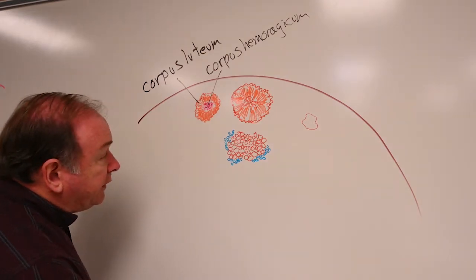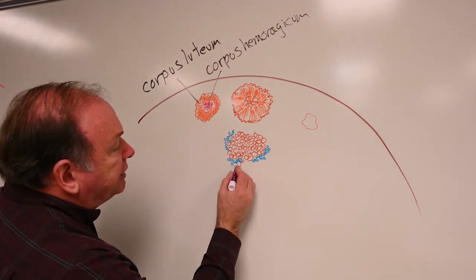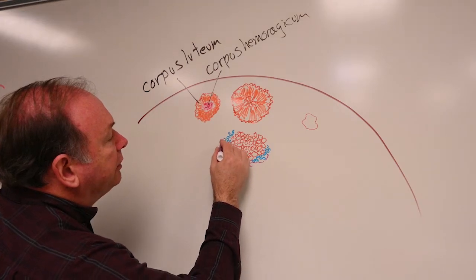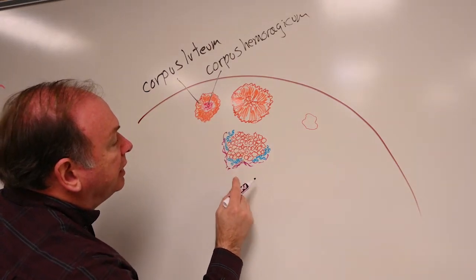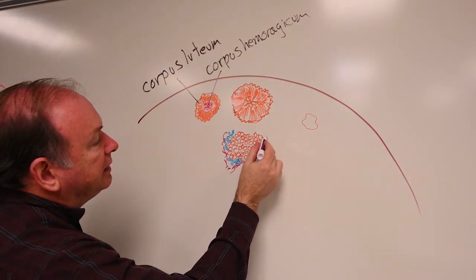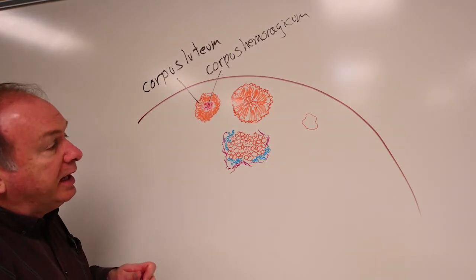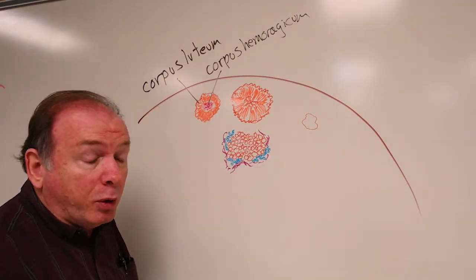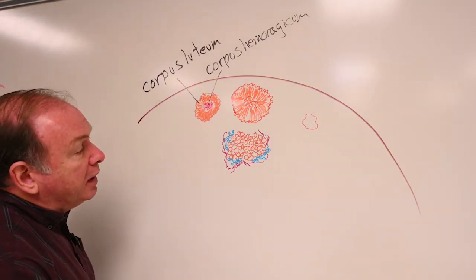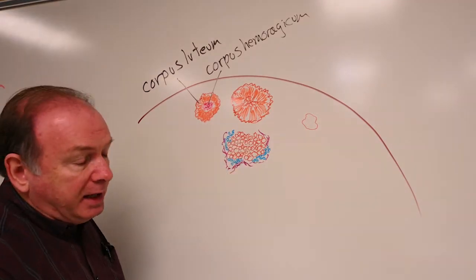In addition to those features, we also see some fibrous tissue derived from that theca externa. So running through here, dividing up sections. So this would be a huge thing, but anyway, you'll see little bits of this theca externa worked in among those hormone-producing cells, more of a structural tissue, a fibrous tissue in among the hormone-producing cells derived from follicle cells and theca interna cells.